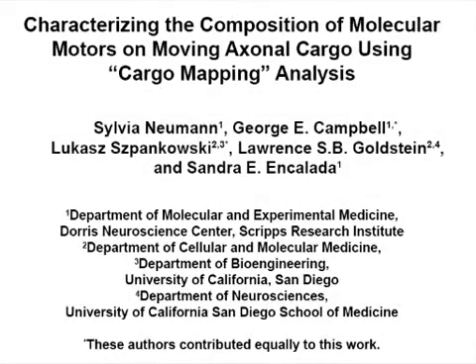The overall goal of cargo mapping is to determine the relative amount and type of molecular motor proteins that associate with and move vesicular cargoes, and to correlate this composition of motors with the directionality of live cargo movement.